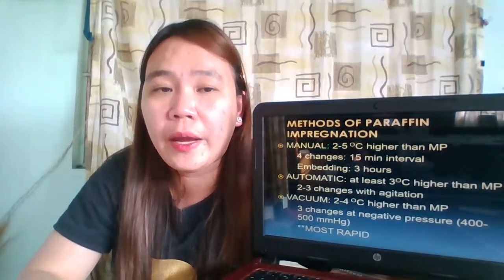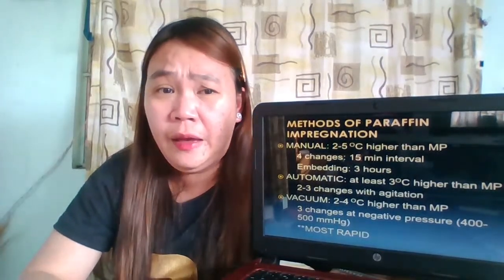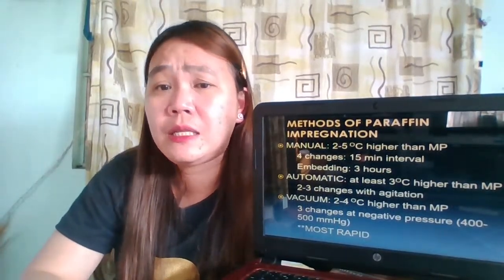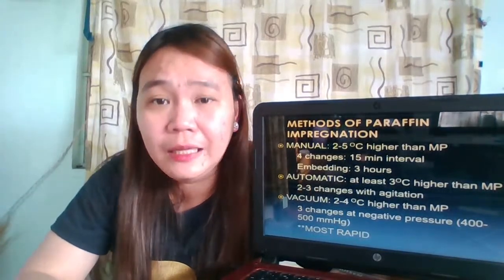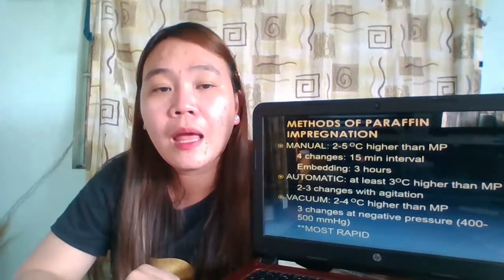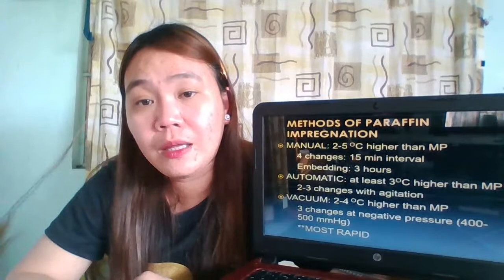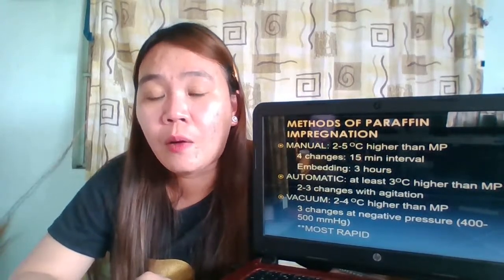What is the required number of changes? Four, at 15-minute intervals. So four changes at 15-minute intervals, and then embedding is carried out for 3 hours.